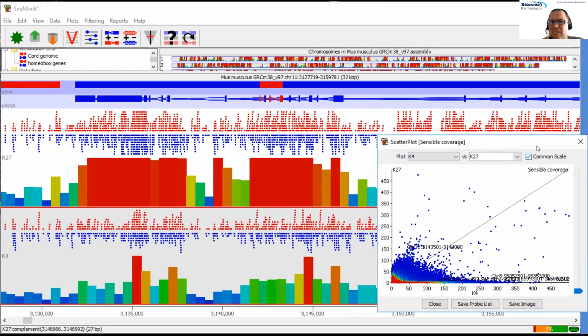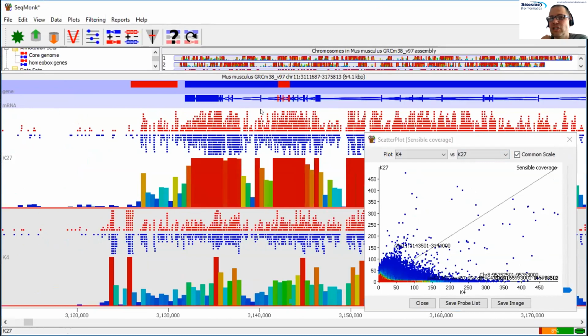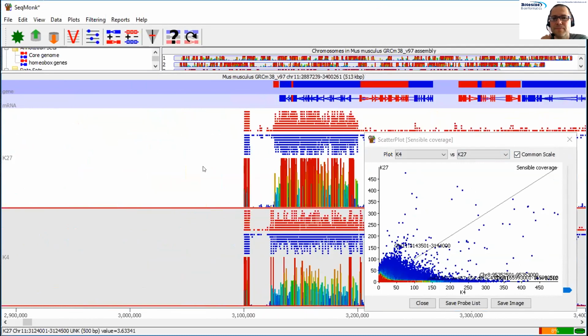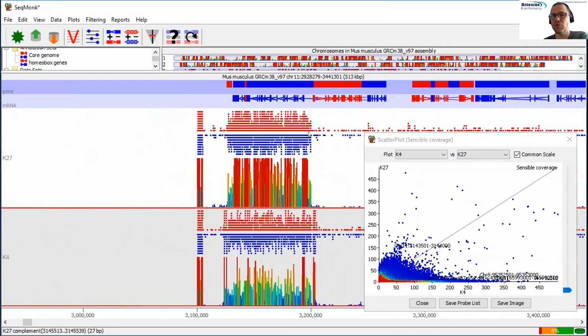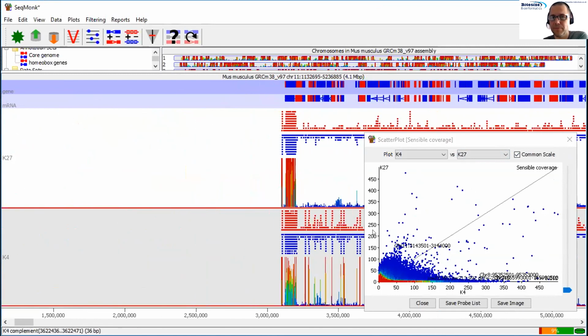People who've worked in bioinformatics for a while learn certain genes that smell bad, and SFI1 smells bad. It's a gene that's on the end of the chromosome, and you get variable duplication of the end of this chromosome. So actually the copy number of this varies hugely. So although there is a difference here, it's probably because the genomic copy number is different, and you can see that it's on the end of the chromosome because there's the end over there.